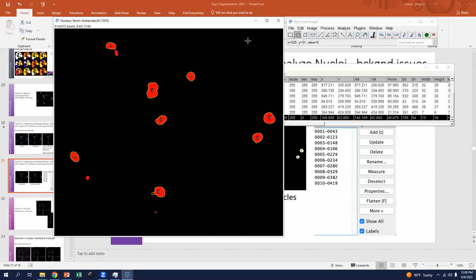Great, so now when you click on one, it just goes and changes it. Perfect. Now that's what I'll tell people to do. We had some issues with the result.